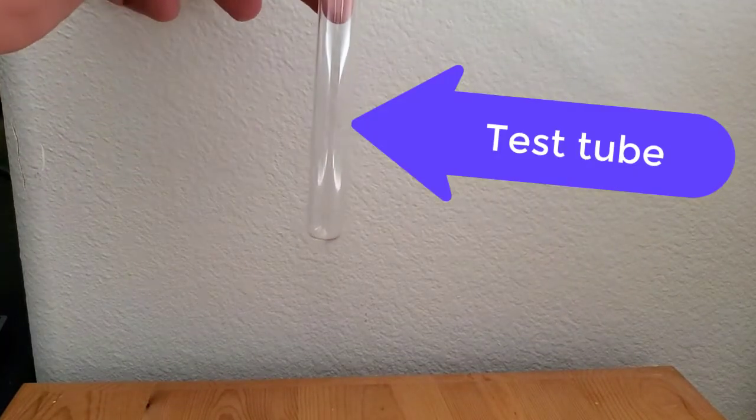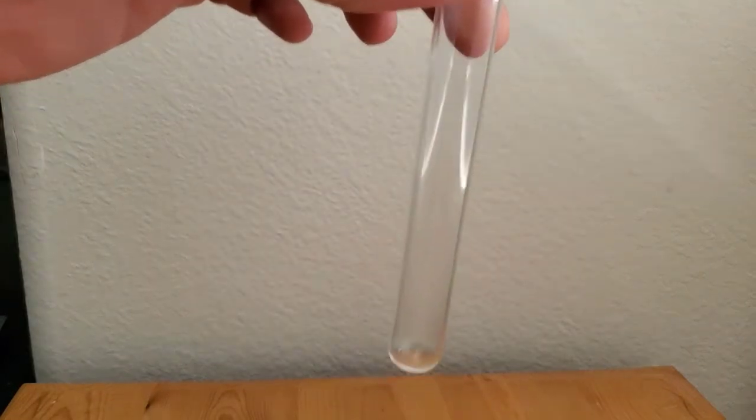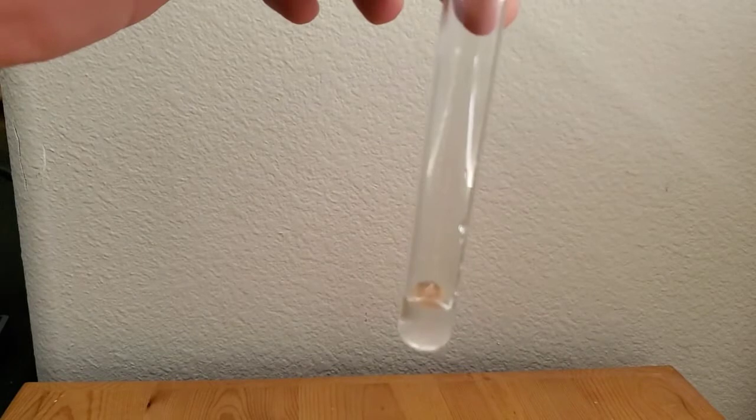Here you have a clean and dry test tube. I'm adding water to the test tube.